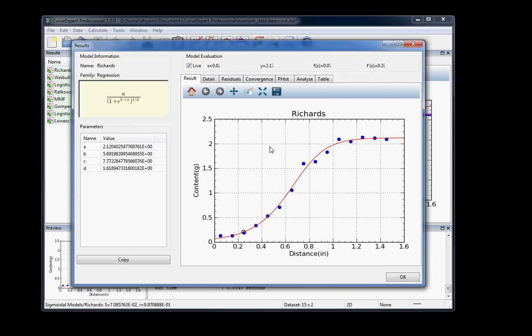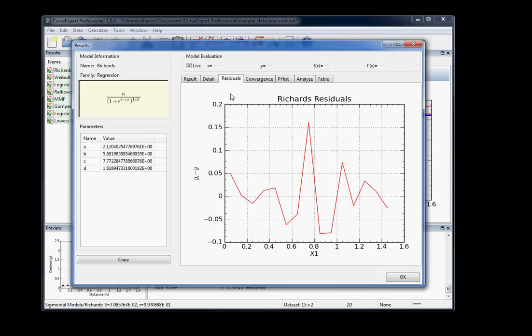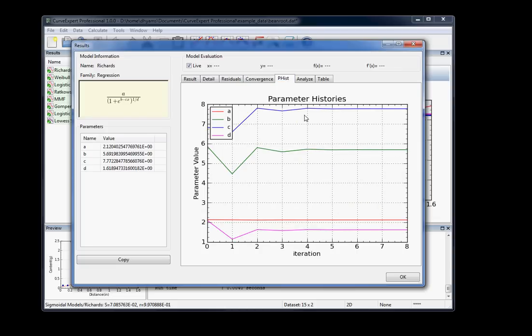It'll show you the parameters, the equation, a nice little evaluator that runs along the result line there. If you want to get detail on standard area, covariance matrix, parameter uncertainties, and things like that, it's here. You've got a residual plot, residual history, parameter histories as a function of iteration there.